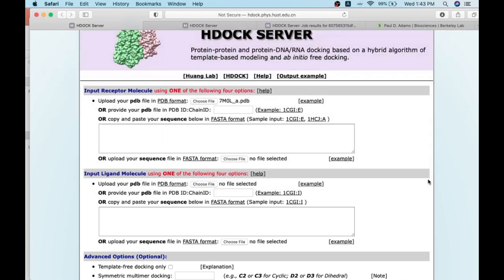I want to see how these two molecules are interacting — two inputs, chain A and chain B. I want to predict the docking between these two molecules, see how the interface is established and how strong it is. The given case is mitogen-activated protein kinase, PDB ID 7M0L, and I have given two chains as specific inputs.